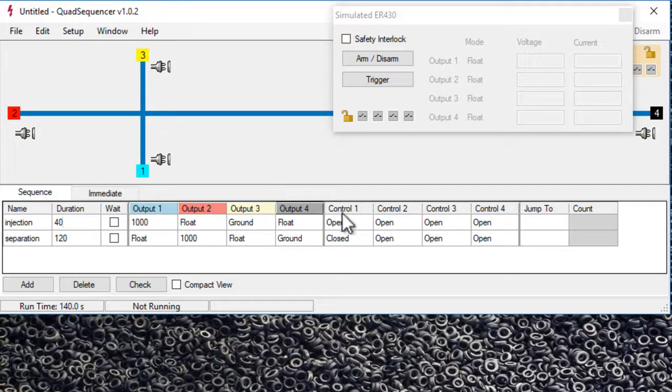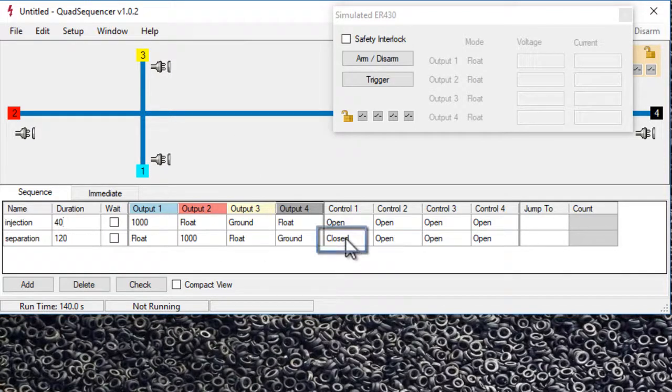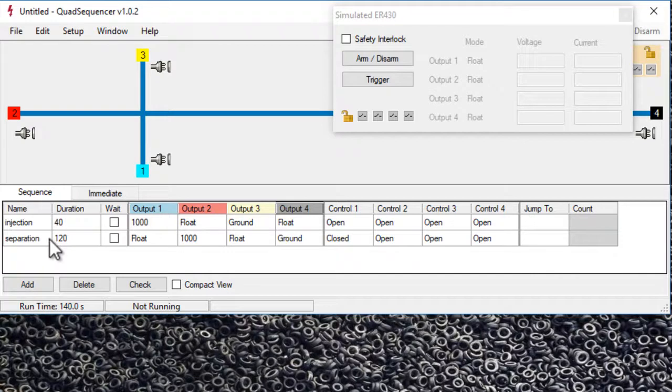You can see in the sequence control one, just at the separation step, it's closed. So it's going to send a message, for example, to PowerQuib Software to start recording the data at this separation step.